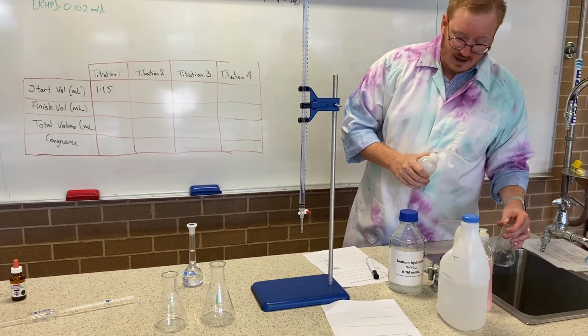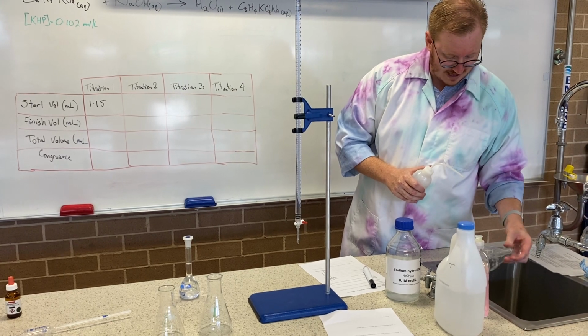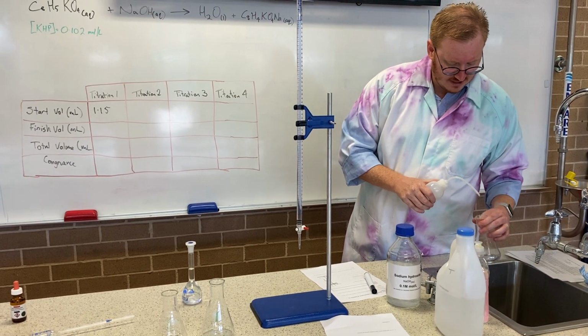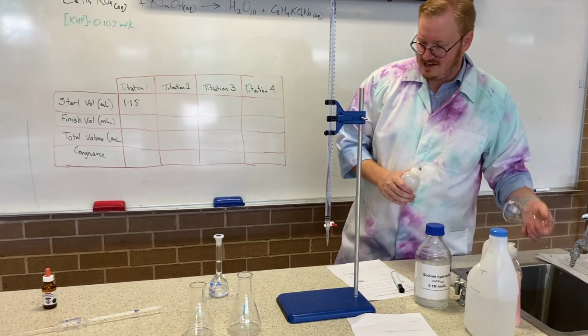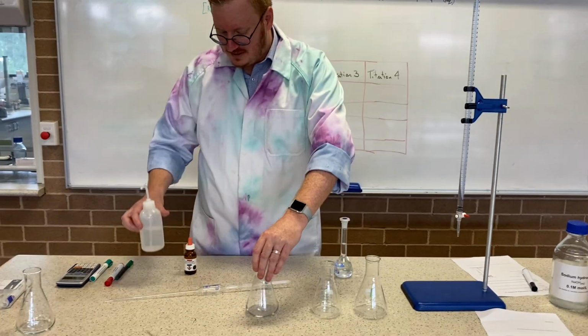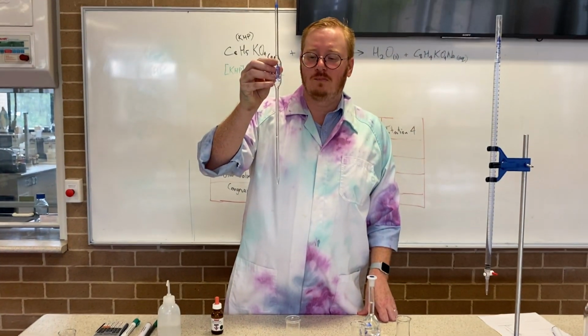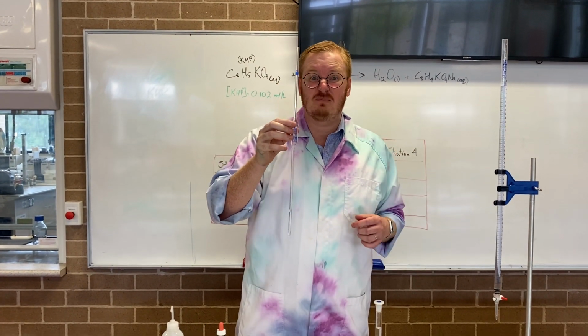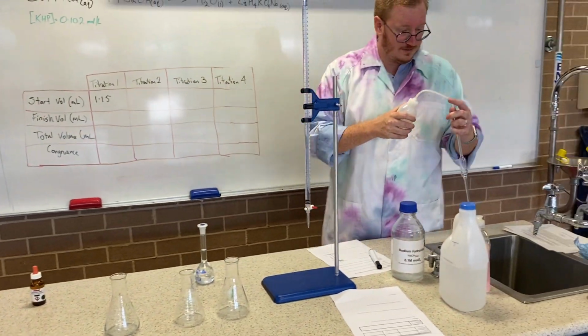Now, as I was just saying about the acid, our KHP solution, did I already do that twice? That's okay, I'll do it 3 times. KHP solution, I need 25 mil, so I've got a 25 mil bulb pipette. I need to prepare that, okay? So like everything, twice with water.